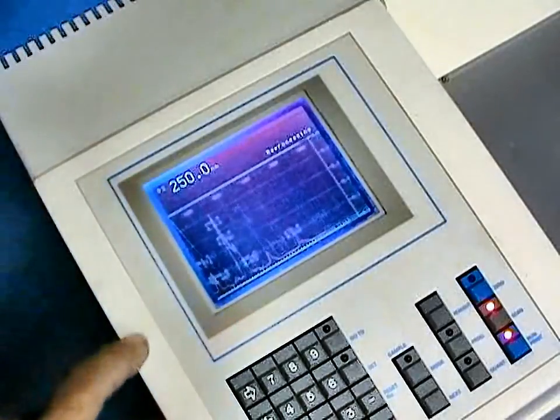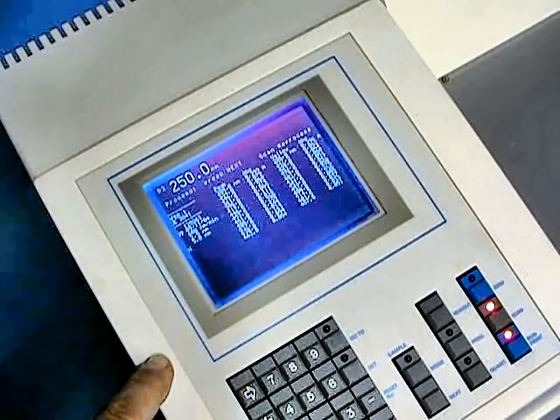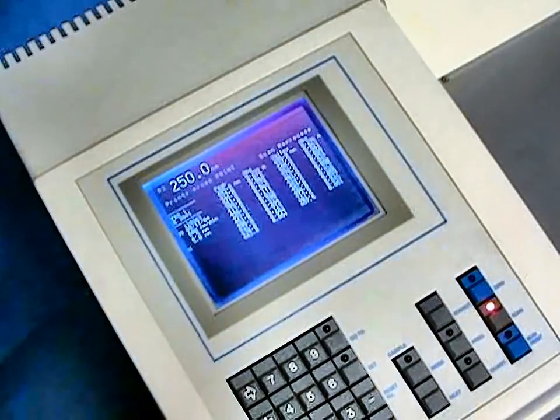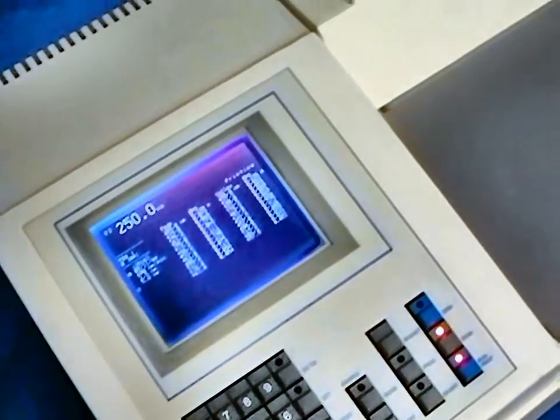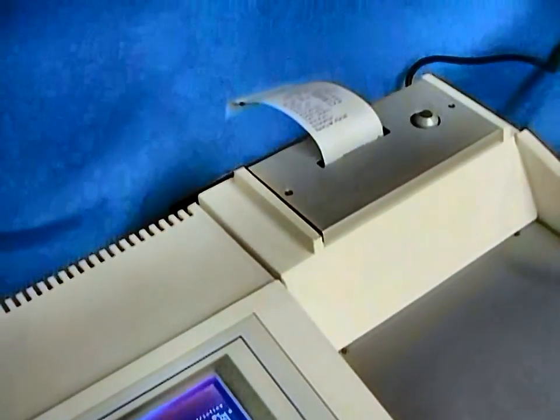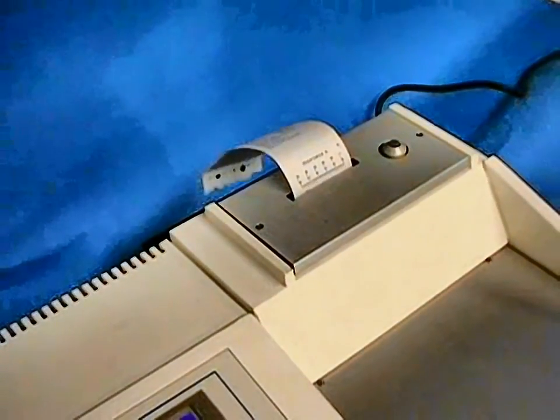By expanding the spectrum to build a scale, we can get more specific information on the peaks and valleys for doing integrated areas. If this is acceptable, we press the print key, and the spectral information and data table are sent to the small cash-register style printer that is part of the CECIL system.